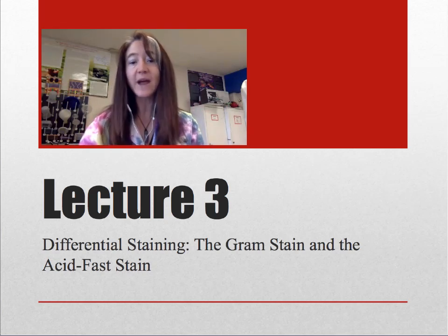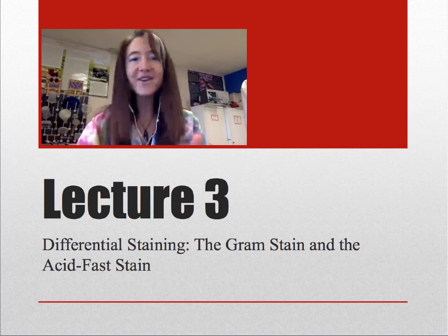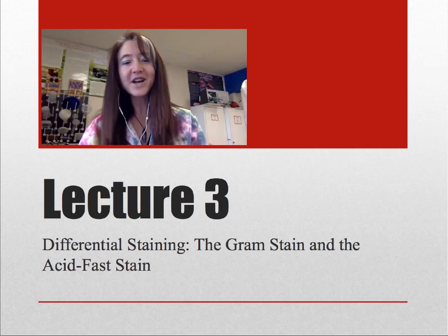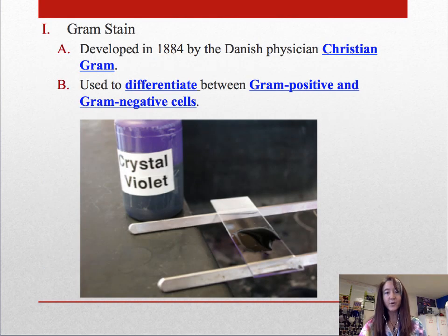Today we're going to cover the Gram stain, the most famous of all differential stains, and one that will be a part of your life from here on out if microbiology stays a part of your life, as it should. And we'll talk about the acid-fast stain as well. So let's begin with the Gram stain, developed by a Danish physician in 1884.